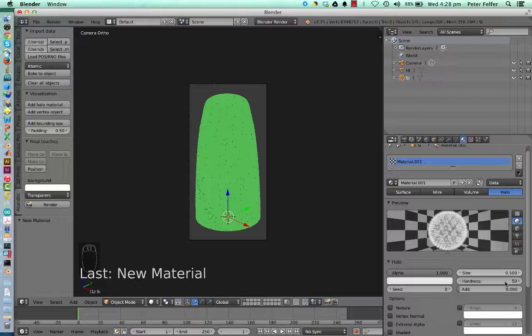The first thing we want to change is the hardness. We want the hardness to be 0, so we want to have a circle that has a distinct edge. So we'll set that to 0. One thing that I've just noticed, it's probably because I'm doing the screencast recording, but it's slowing down a little bit. So one thing we might actually do is downsample our data set, downsample the silicon in this case.